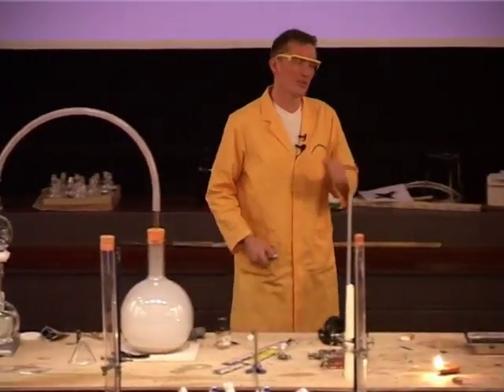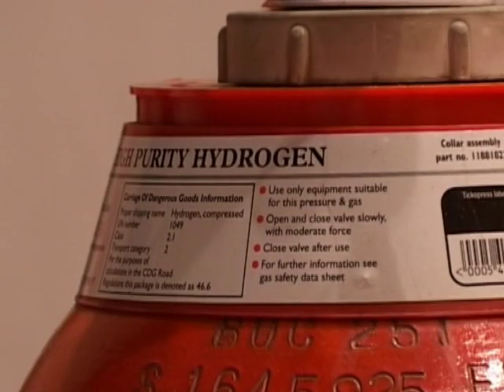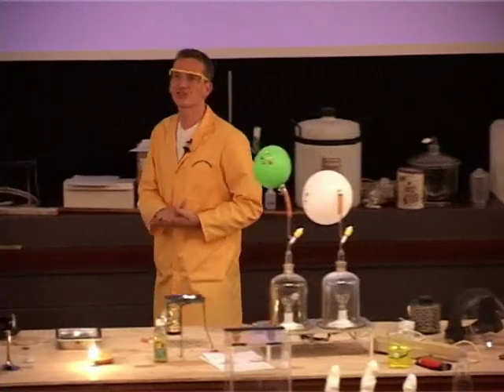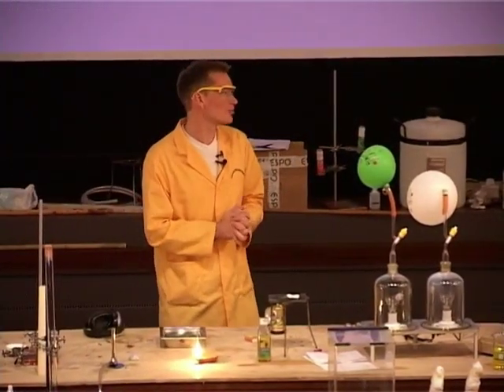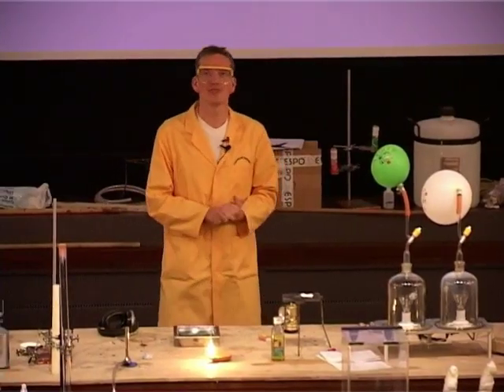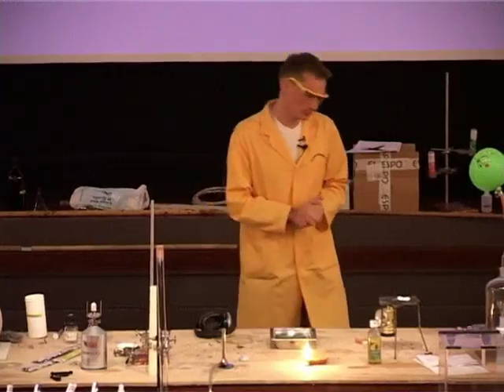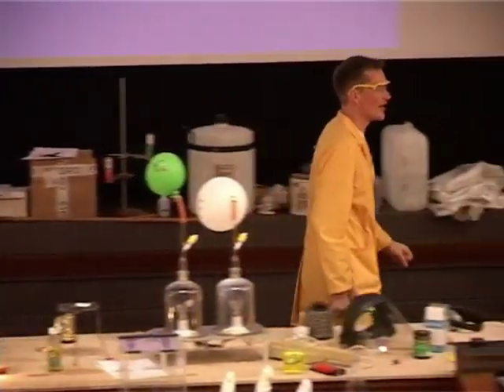Okay, so that was an element, phosphorus, the light bringer. We're going to go back now to our hydrogen. And if you remember, the hydrogen didn't really give out very much light when we tried to burn that, but we can get some light out of this, if we're rather clever, by heating up something that gives out some light. So this is what we're going to try now.